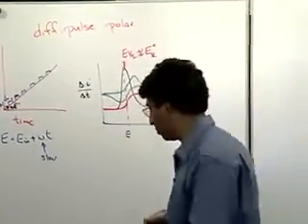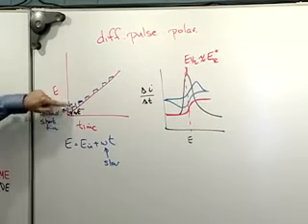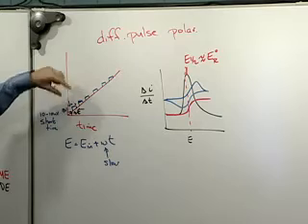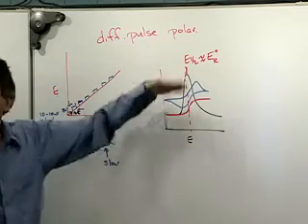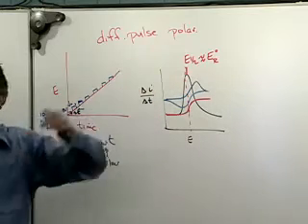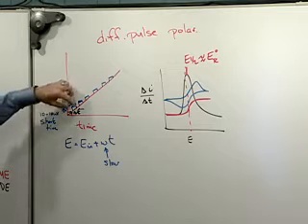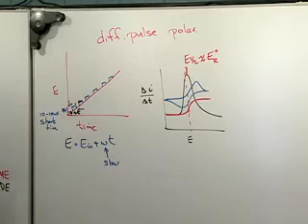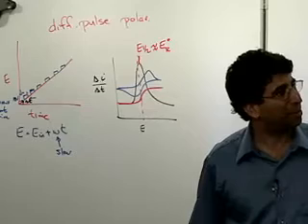When you do this, I should point out, you typically have control over how big this little perturbing potential is and how long you dwell here. And obviously, the bigger the potential is and the longer you dwell here, then the more gain you're going to have and the bigger your signal is going to be. But also, the more digital it's going to be. That is, you're going to start missing points. If this potential gets too big, it perturbs your ramp too much, and you have made a change that you don't want to make. So there's something about looking at the forest or the trees or something here, right?